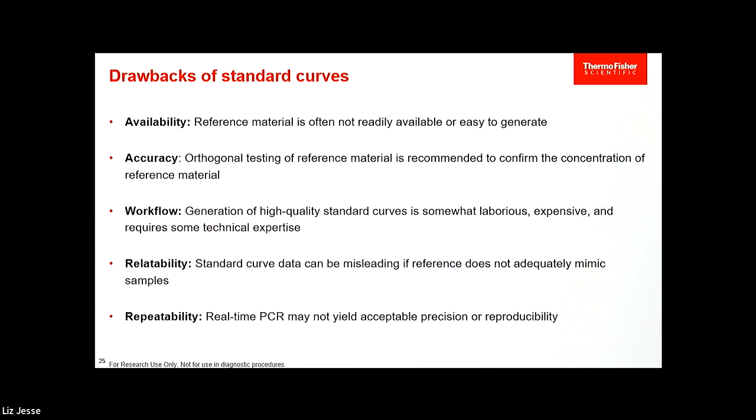So as I kind of reviewed, the availability of your standards, the accuracy, is it the same as what you're using? You are also reliant on the company that sold it to you that says this is exactly how many copies per microliter you have to start with. So here, you go ahead and create your standard. The challenge is before digital PCR even came into play, digital PCR is now used to quantify your standards. So even if you continue to use standards in qPCR, you can utilize digital PCR just to accurately make sure that the standards you're using are exactly what they say you're using.